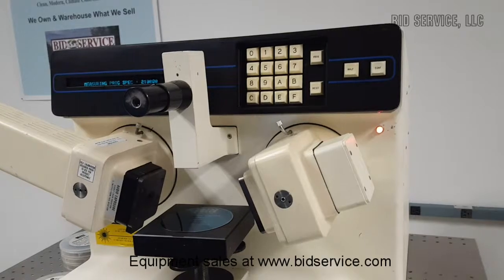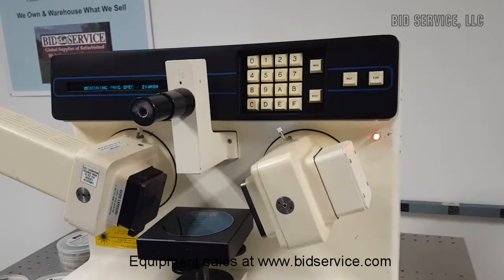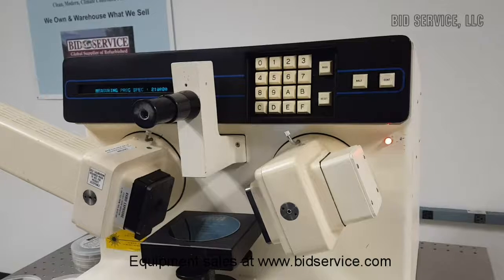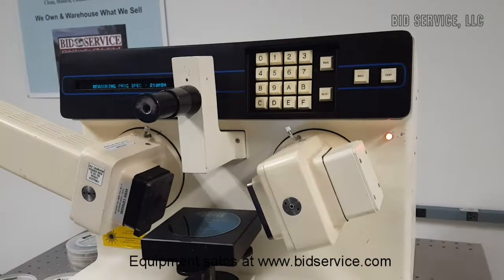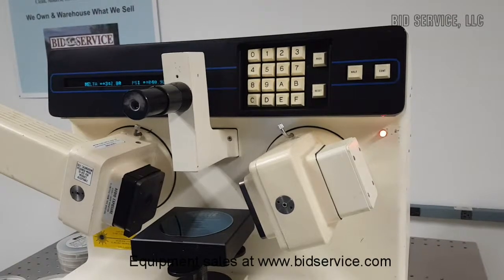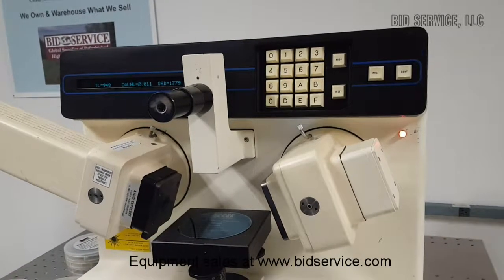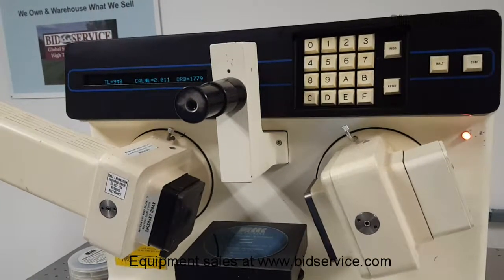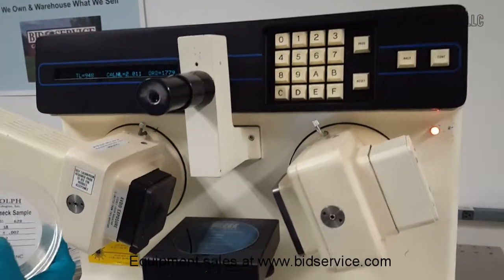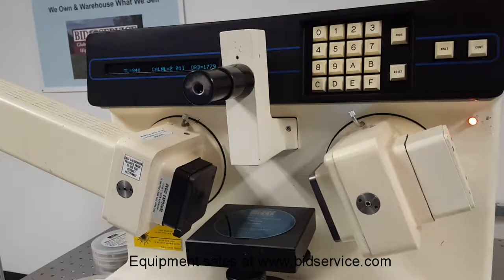These standards will not be included with the machine as they are for demonstration use. Film thickness measurement standards from either NIST or other sources such as Rudolph Technologies are available — they must be the same material as the film of interest. The measured thickness is 948 angstroms and the refractive index is 2.011, which is very close to the expected value — it's a good result.